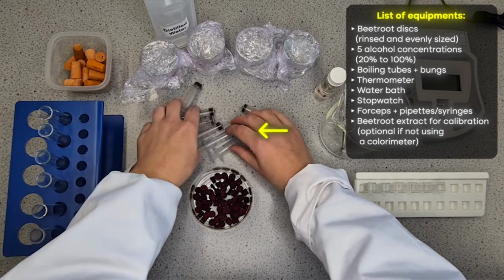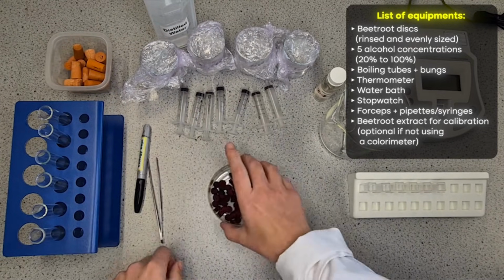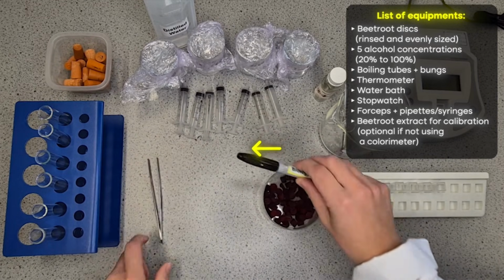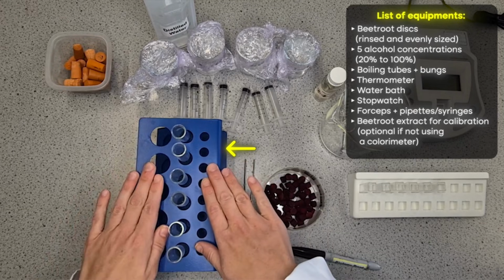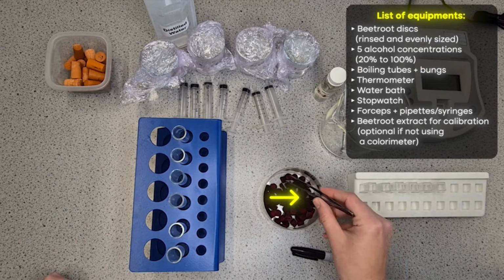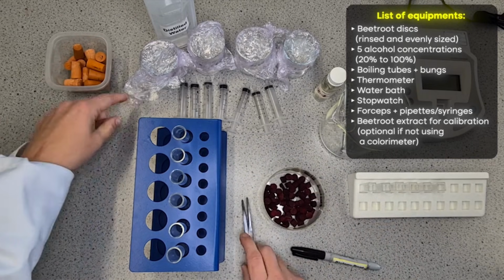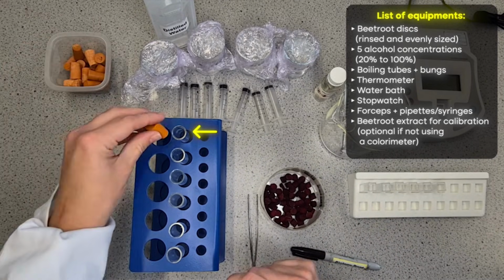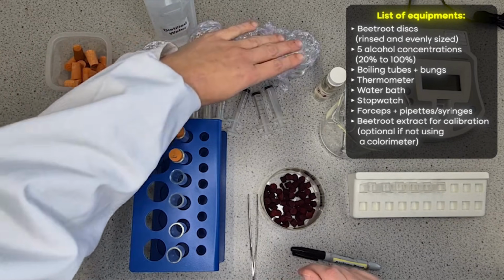And then I've got a different syringe for each of those so we don't cross-contaminate. I have permanent marker so I can label all of the test tubes so I don't get any of those confused. And then I've got my test tube rack to hold the test tubes as well when I'm not using them. Forceps so you can transfer your beetroot discs into your test tubes. And then one of the key things, we have a bung that's going to go on top of all of those. I've got some cling film on as well.